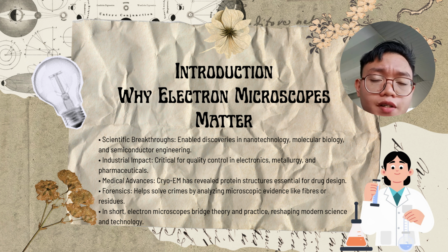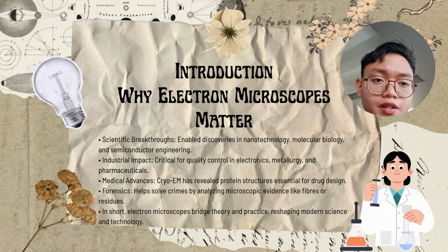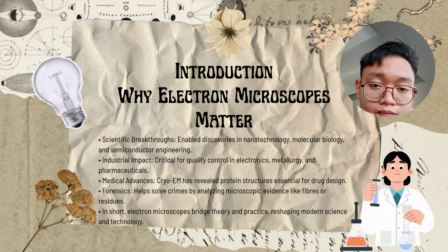Next, we take a look at some of the electron microscope's contributions to humanity. Some include enabling discoveries in nanotechnology, molecular biology, and the semiconductor engineering industry. For industrial impact, we can see that it is critical for quality control in electronics, metallurgy, and pharmaceuticals. In medical advances, cryo-EM has revealed protein structures essential for drug design. And in forensics, it helps to solve crimes by analyzing microscopic evidence like fibers and residues. So, in summary, the electron microscope bridges theory and practice, reshaping modern science and technology.